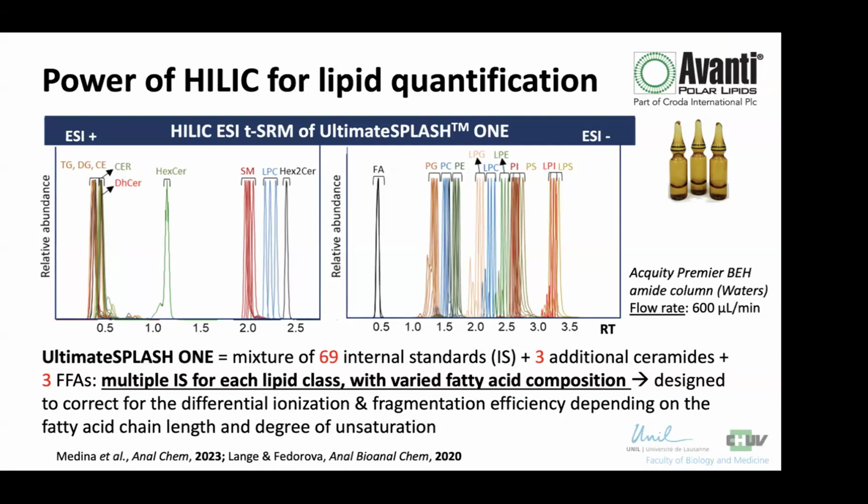Okay, perfect. Because personally, I don't see the 3 minutes costing you much in terms of time to get what is probably going to be much better data in terms of reliable data. Yes, especially when it comes to, as I said, lipids that are lower abundant, especially compared to the neutral lipids, because neutral lipids are really the most highly abundant. And with direct infusion analysis, there is no issue to detect hundreds of these neutral lipid species.